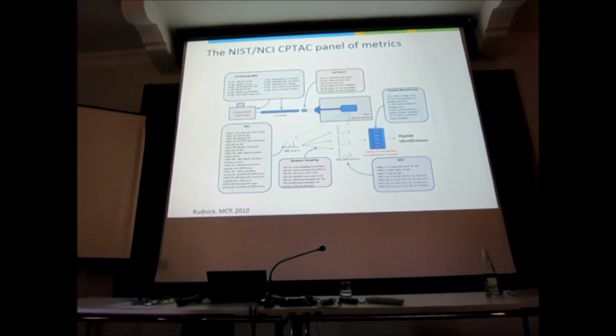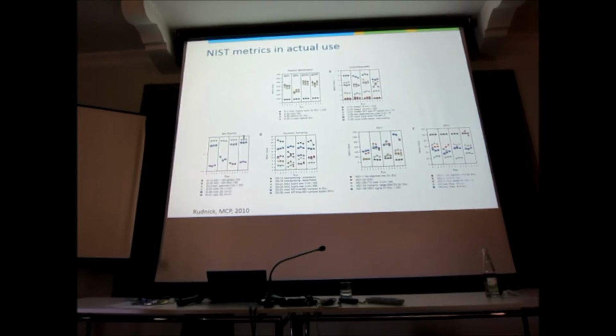And so they started looking at the workflow and they said, how can we measure quality at as many of these places from a single raw file? You need nothing but a single raw file. And they came up with all these metrics, some of which are redundant, and they started scanning this for all the CPTAC data. So out pops stuff like this, peptide identification.